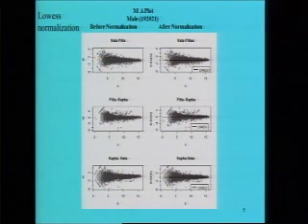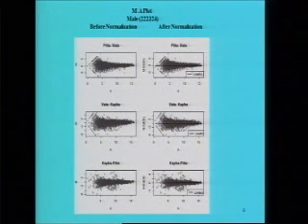The lowess fit line also passes through the cloud of points. Same picture is revealed for Pitta Kapha MA plot data and Kapha and Vata MA plot data. This shows that this lowess normalization is successful in reducing the impact of dye bias. This was for these three slides, and the next picture is again similar, for another group of three slides. So the first step was lowess normalization to take care of the dye bias.